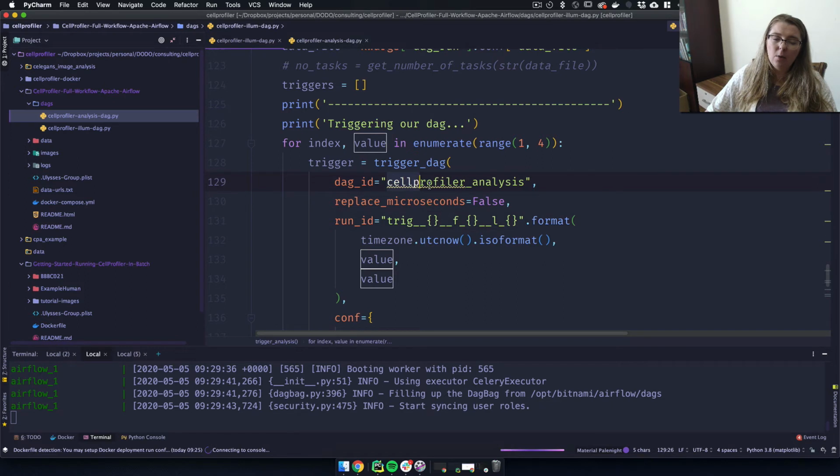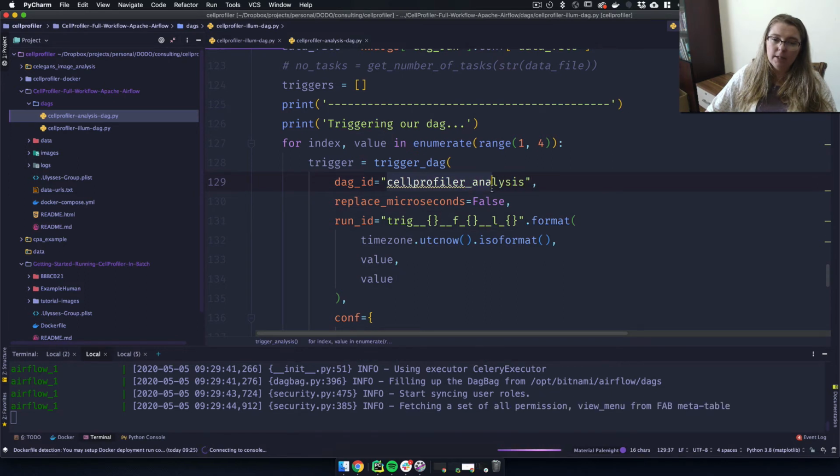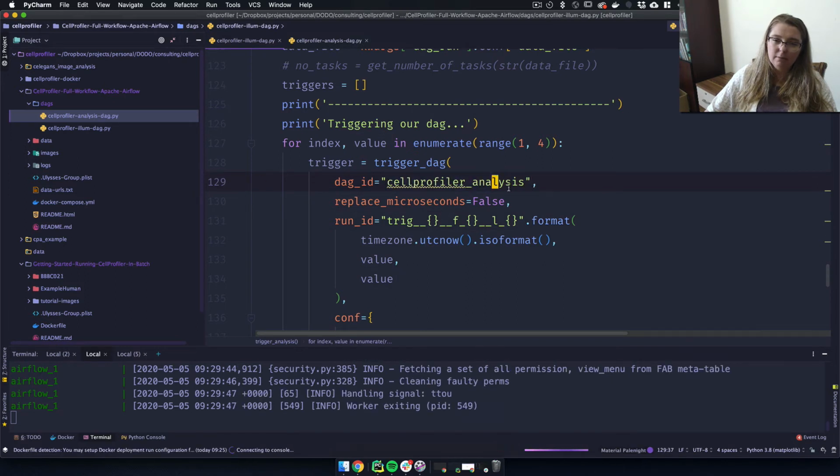And I do just kind of want to say this is probably not exactly the way that Airflow expects to be used. Airflow expects to be used more in this kind of situation where you have your analysis completely mapped out. That doesn't always work for me because I tend to have much more programmatic analyses where I need to do a step and then programmatically figure out the next step, figure out the next step, figure out the next step.